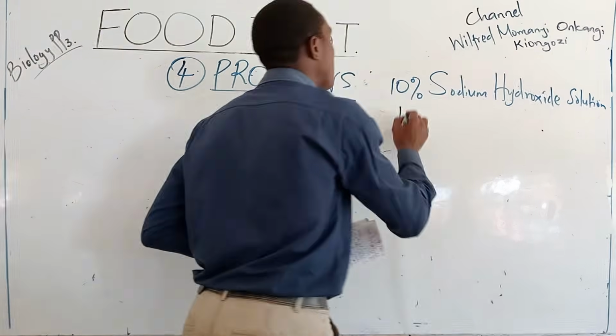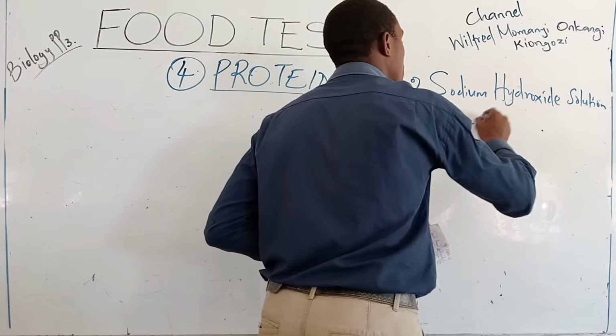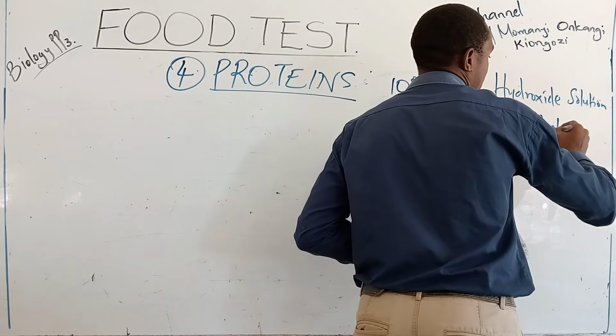We also have 1% copper 2 sulfate solution.